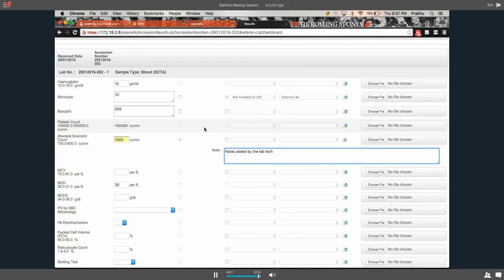So I think one problem with that would be that if you don't put in a value, the test would still show up as not complete. Yes, that could be irritating. That's the only drawback, so we'll have to find a way to get around it. Normally notes are used to depict stuff like this test is pending or some additional information. Does the note go back to OpenMRS? Yes. Oh, good.